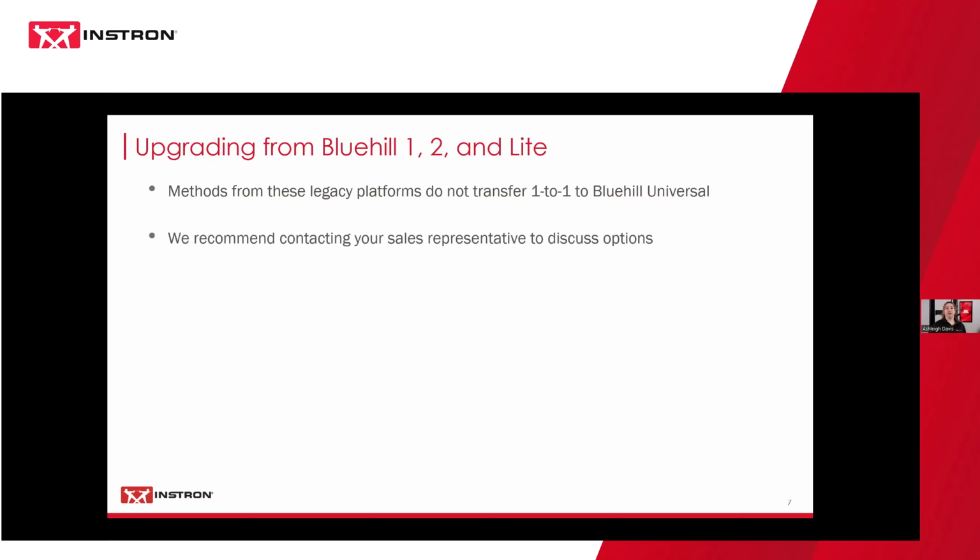So what's going to happen with the upgrade is that your field service engineer comes on site and they will help you to convert 5 methods. And it's very likely that that's going to have to be something that's manually done, so manually restarted over. But that's also why we provided you with those method templates, like the plastic standards, the metal standards. Because if you are testing with standards already, then those have pretty much already been created within Bluehill for you.